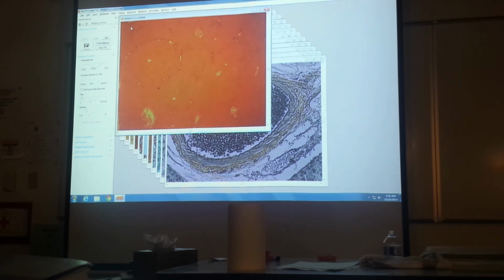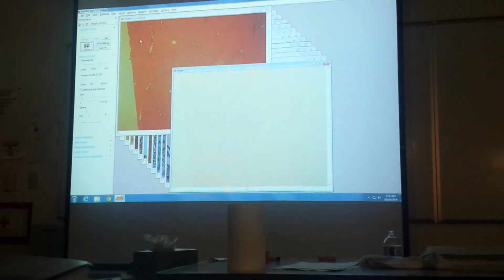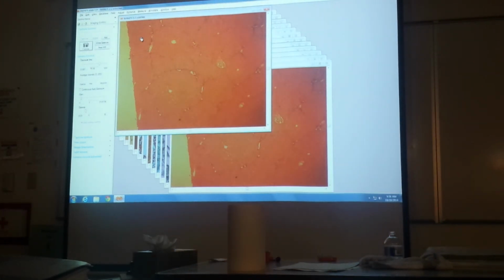Before the shower drain. We're trying to find the central venule. Either of these is pretty good. See the lobule structure? Blood filters, it percolates toward the shower drain, or the central venule. Okay. I'll give you this low mag picture. And I'll focus in on one of them.